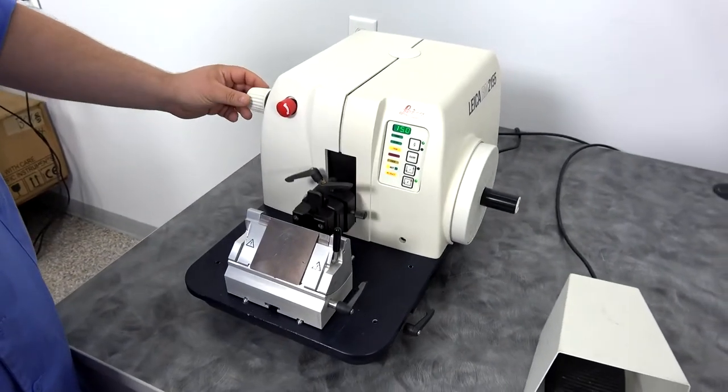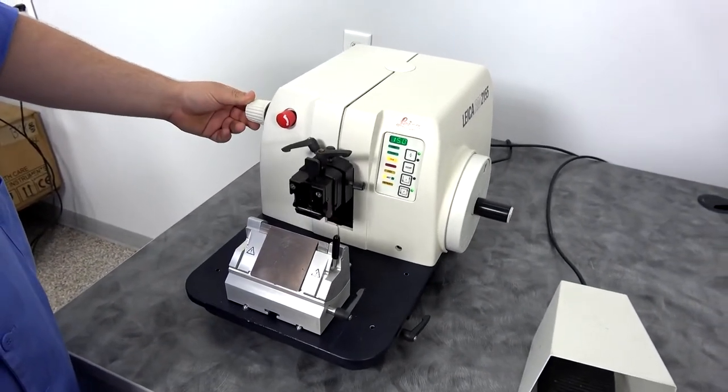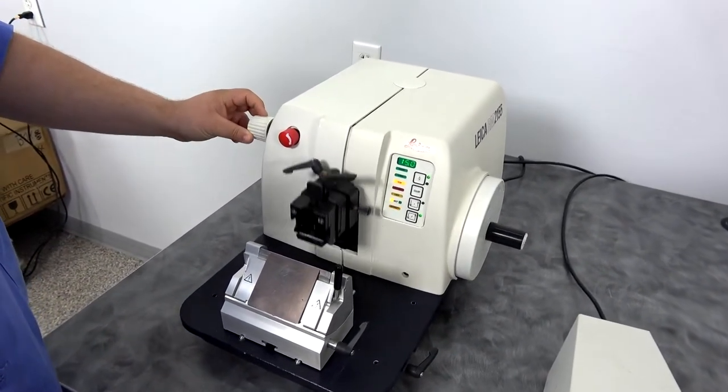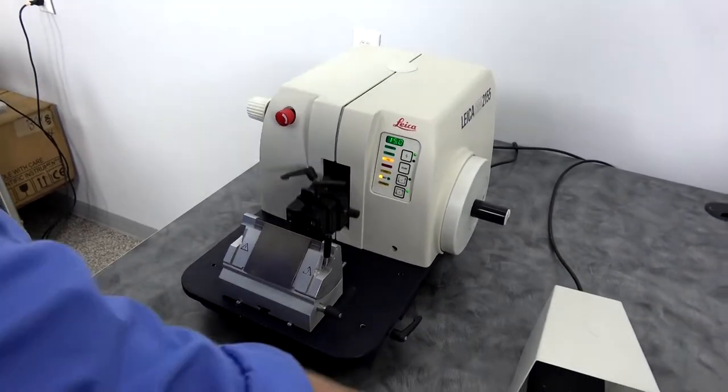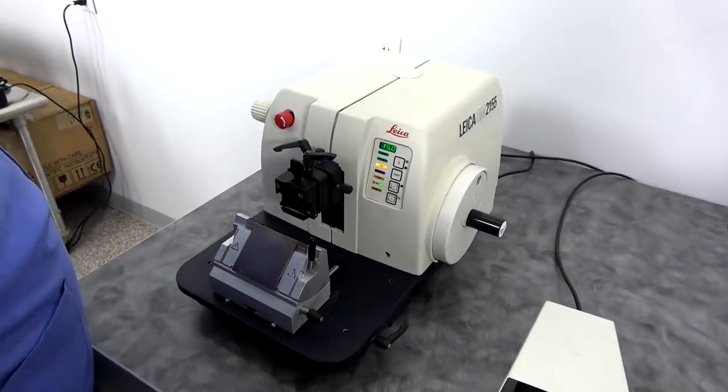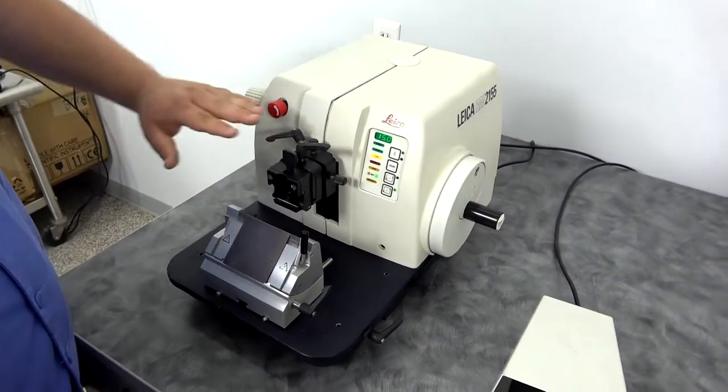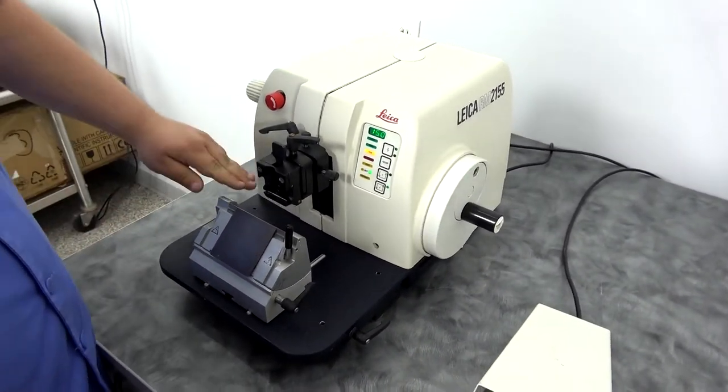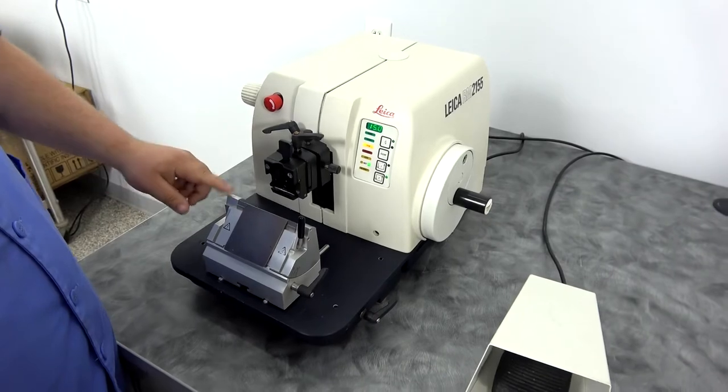When it's running, you can go in and adjust the speed of your cut, either quicker or slower. And then to get it to stop cutting, just tap that foot pedal again. It will always stop at the top to make sure you have a safe area to move your wax block and your blade.